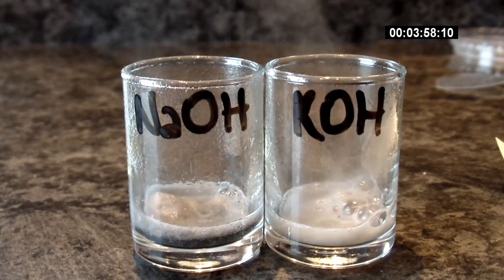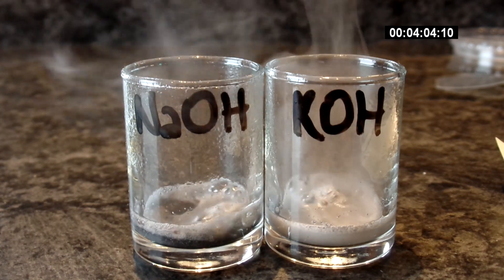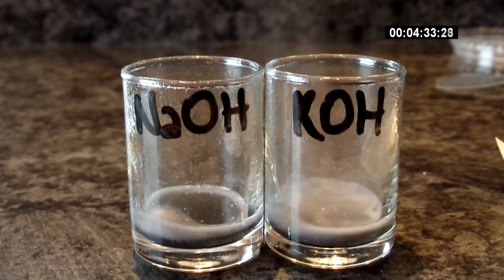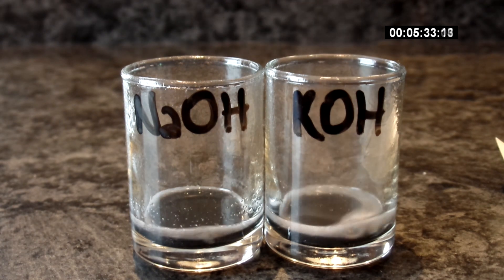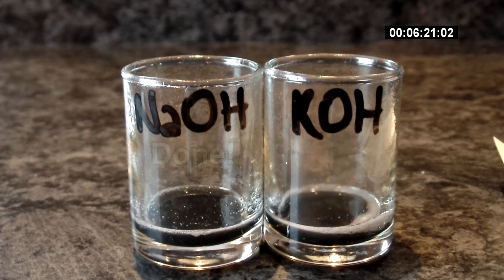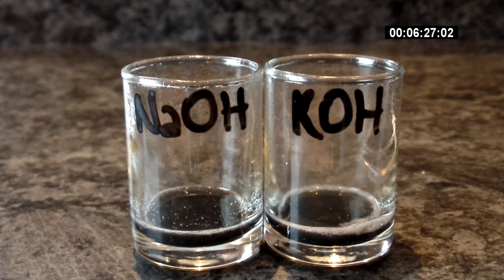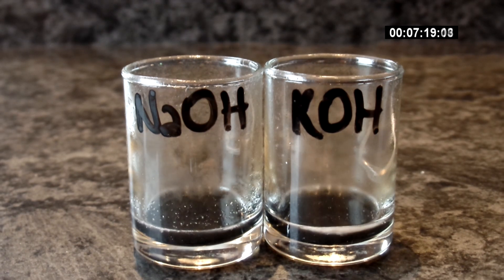This shows how important stoichiometry and concentrations are when doing chemistry. Sodium hydroxide still won, but only by a minute.